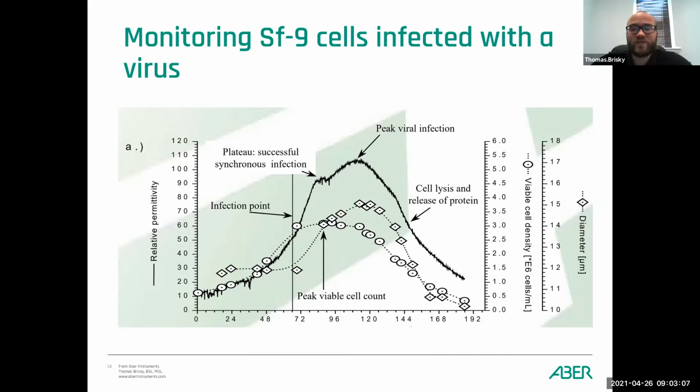After infection, you clearly see that the offline cell density plateaus, whereas capacitance kept increasing sharply. And this is exactly the time you may have noticed cell size begins to increase as well. So this was clearly a case where capacitance was responding to the cell size changes, and this was quite valuable information for the process because the capacitance profile and its increase post-infection was used as a parameter to determine successful infection.